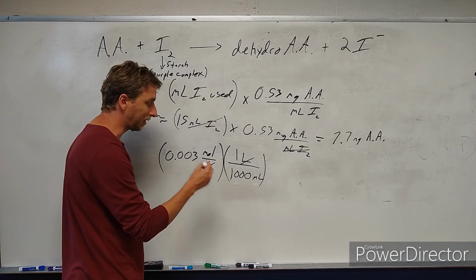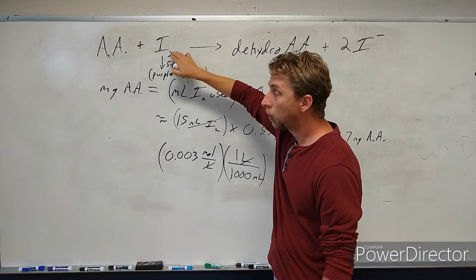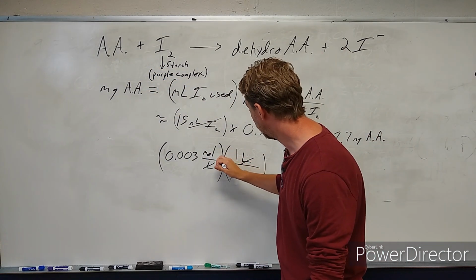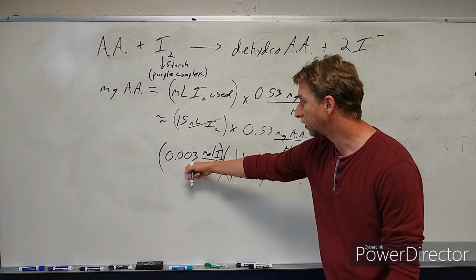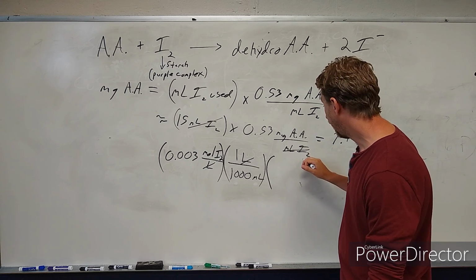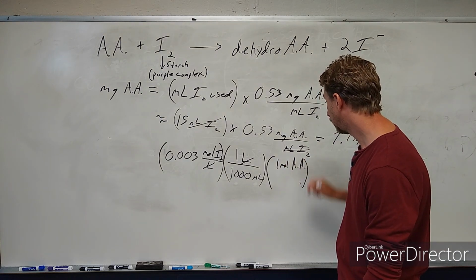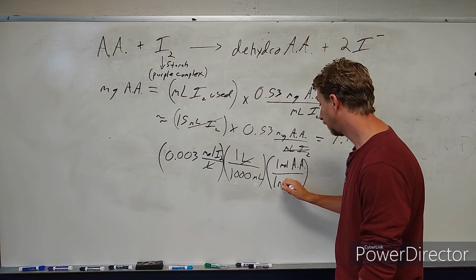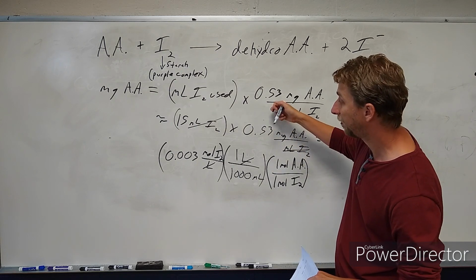Now this is of an iodine solution. Now, from the balanced reaction, this is the key. This is called the mole-to-mole conversion. We know 1 mole of iodine reacts with 1 mole of ascorbic acid. So I'm going to put in here, this is moles of iodine, right? That's what we're talking about for this concentration. And we want to know how many moles of ascorbic acid will that react with? Well, from the balanced equation, we know 1 mole of ascorbic acid reacts per mole of iodine. And again, this is just background information to see where this 0.53 comes from.